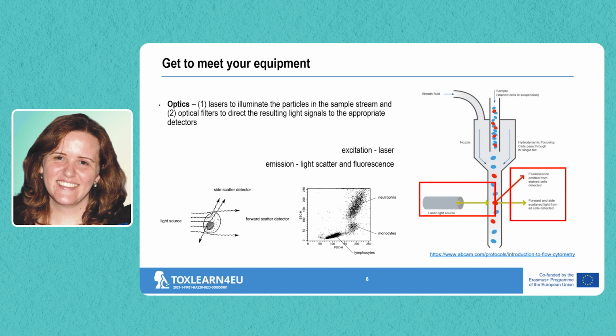So you will have cells with lower size and lower complexity. You will have bigger cells still with lower complexity, and then you have bigger cells with bigger complexity here in this case. And this is actually a very common case. This is what is usually done to characterize blood cells. Okay, so here you will see lymphocytes, then you will see monocytes and neutrophils here. Okay.